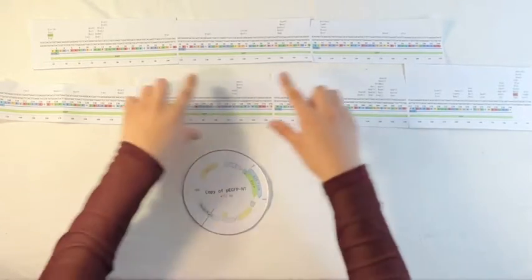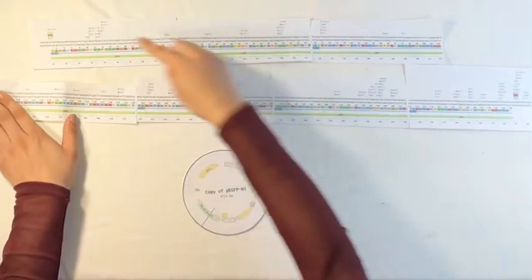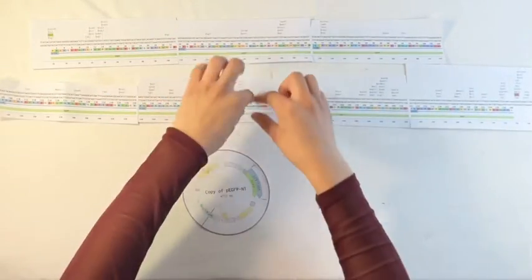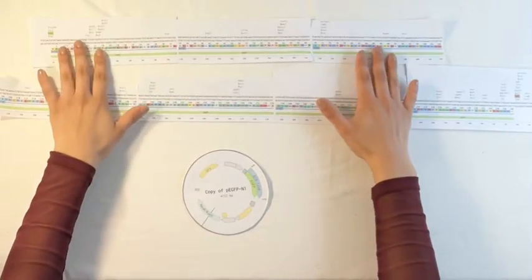Here I have the EGFP gene. It's actually this entire segment here, and it is in circular form, but I did split it up into two different strands.